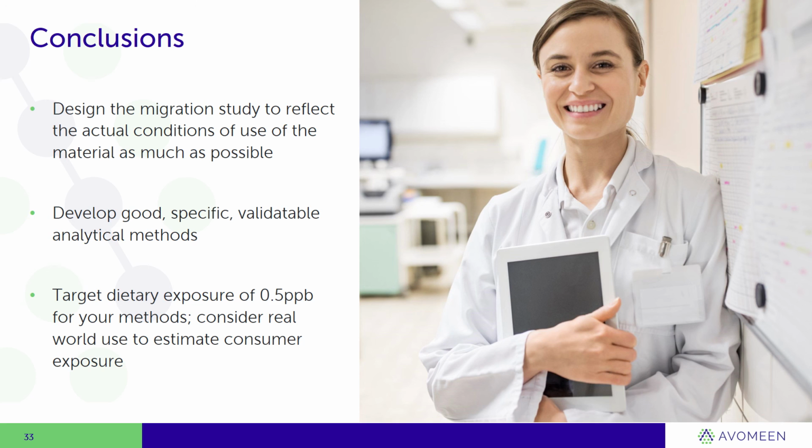Develop good, specific analytical methods that can be validated, and target a dietary exposure of 0.5 parts per billion in the diet for your method. Consider real-world use of your products and the marketing of the product that you are going to be using it for in order to estimate consumer exposure.